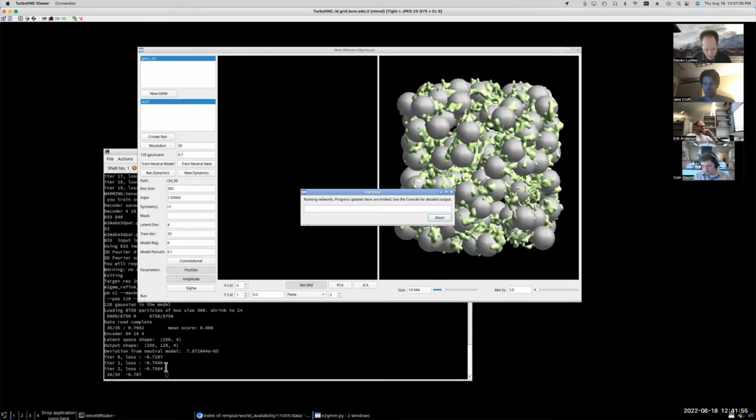Okay, so you can see it running now. It's doing sort of an initial quick training step here first. This isn't the final thing. This is only going to run for like 10 iterations or something like that. Once it finishes that, then it'll do sort of the real refinement or real training, I guess you'd say. Let's just wait till this finishes, and then we can see how fast the longer run is going to run for. I think this is 10 iterations.